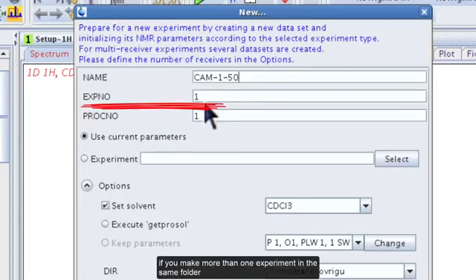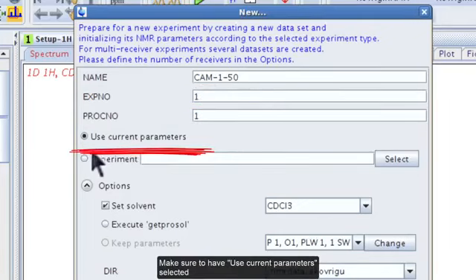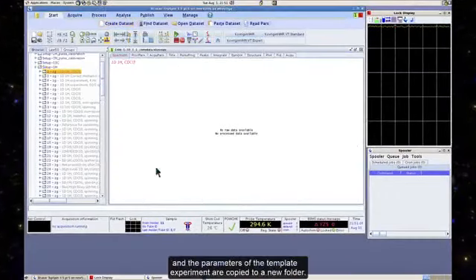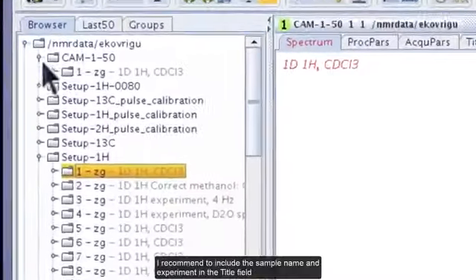The ProSol database, a key feature integrated into TopSpin. It contains pre-calibrated pulse widths and power levels for standard experiments on Bruker probes. The getprosol command automatically fetches these parameters, ensuring experimental setups are quick, easy, and reproducible.